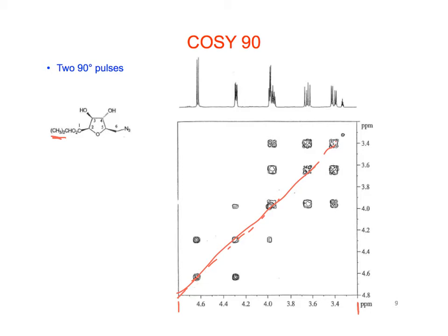Easiest one, I guess, would be the first and the second. Like also on the far left, I guess it's hard to explain. Yeah, no, I think, well, look at the numbers. Oh, okay. Oh, I see. The proton on which carbon do you think you can pick out in that spectrum? For example, which one of those protons would be this one at 4.6 that's the most downfield?